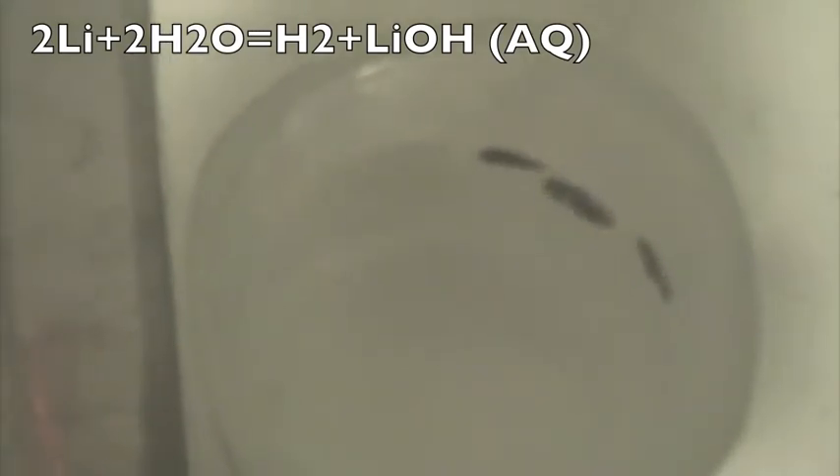And now I'm just going to add it. So, there it is in my hand, and it's shiny when it's cut, and it's starting to react, releasing hydrogen gas and making lithium hydroxide in an aqueous solution.